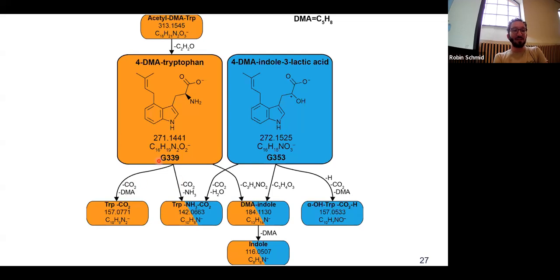If you do this manually, you can see that for this structure there's an NH2 and OH, so just an exchange here, and it's already producing two distinct fragment ions that we can see, and maybe even some neutral losses that I didn't cover here, but two distinct fragment ions that really point out this NH2/OH exchange.